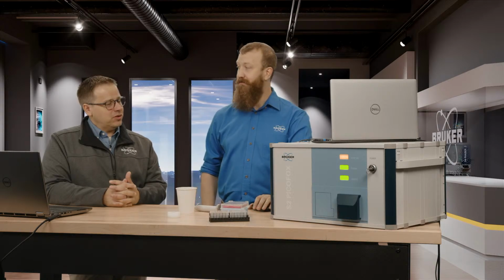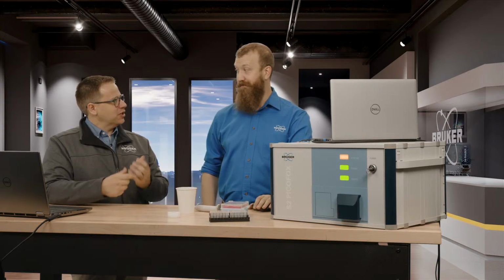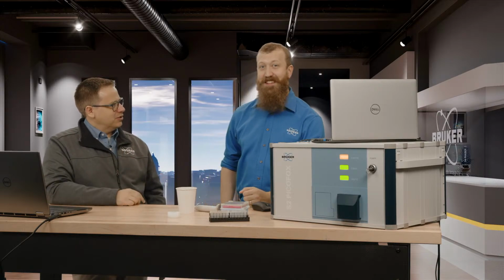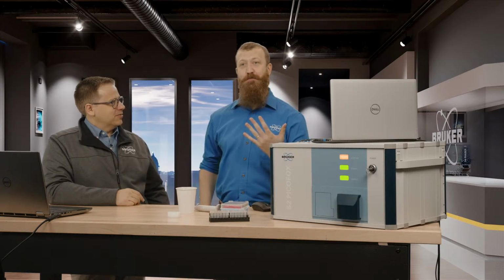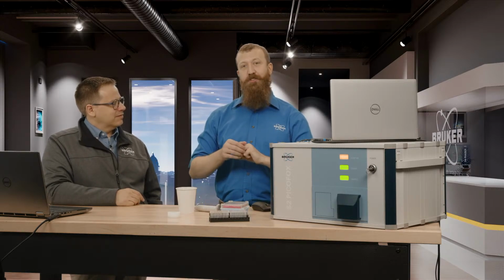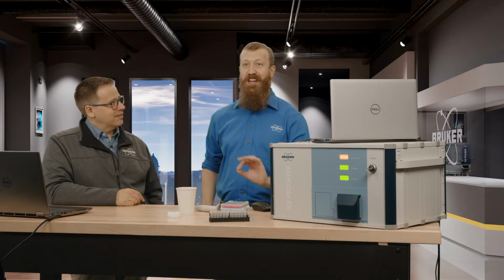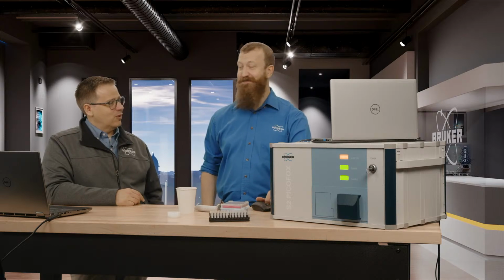Yeah, that's a good point about contamination, because I know you were mentioning even just a gold ring or a gold piece of jewelry, you touch it. Yep. That's my favorite demo to do. If somebody's wearing some kind of jewelry, you can have them rub it with their finger and place a fingerprint on a clean disc, and you can see the metals coming off of that.